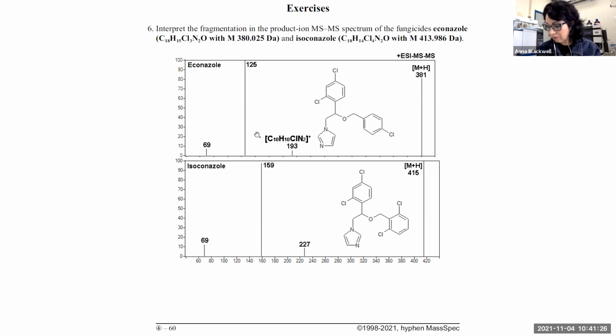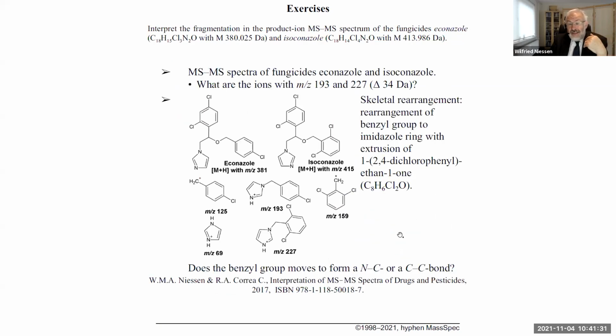And that is consistent with the elemental composition. So there's no reason to think it's going otherwise. That's actually what we see: a skeletal rearrangement where the chlorobenzyl combines with the imidazole, and accurate mass indicates that this is what is happening. And we have seen benzyl rearrangements do occur, so this is a nice example. I like your solution, because it's also my solution.